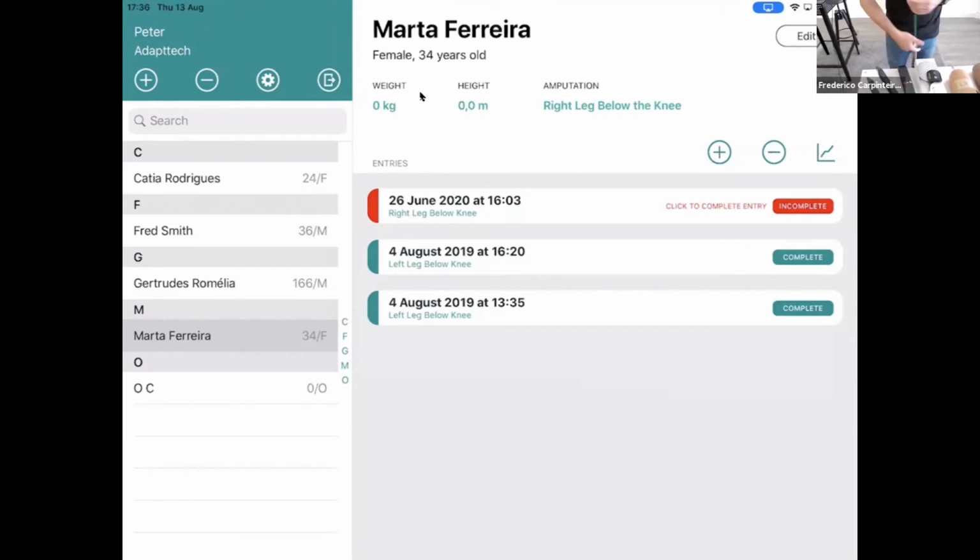I'm going to place the strips in the socket. You just place them in the position that you want, press them against the sides, be careful around the edge to make sure that you don't get any artifacts, and it's done. So I will not place all the strips because I already prepared one socket with the strips connected. So here you go, it's this one.